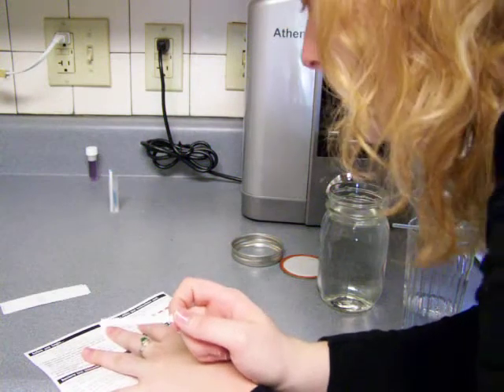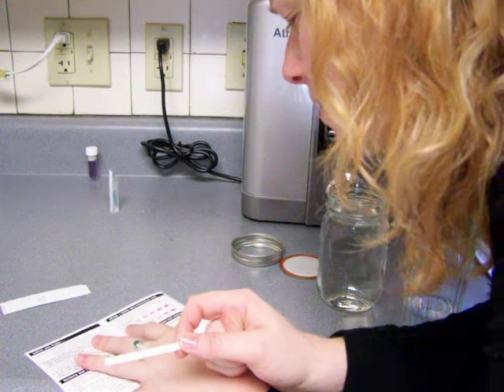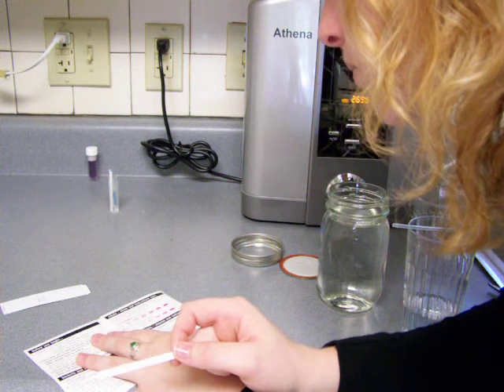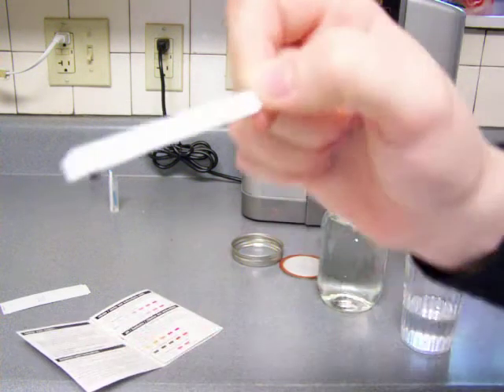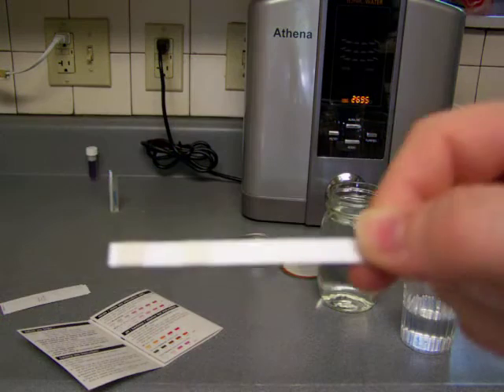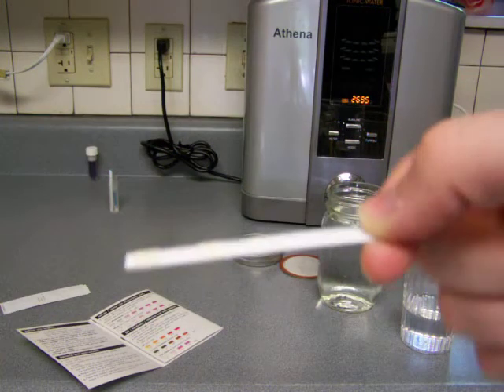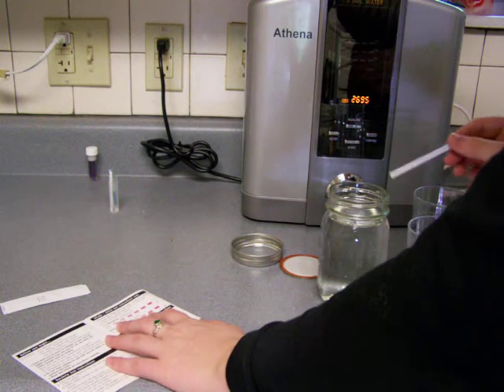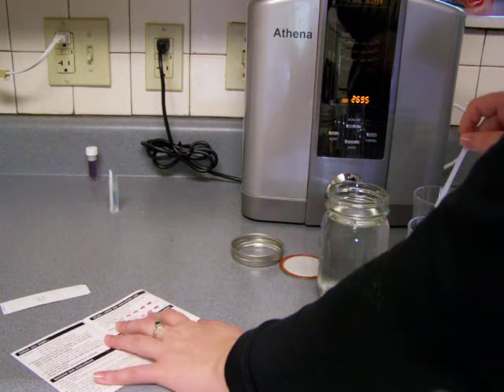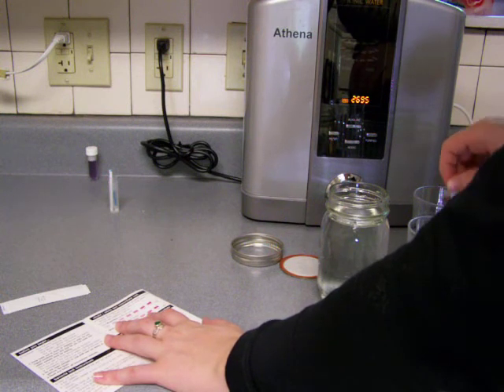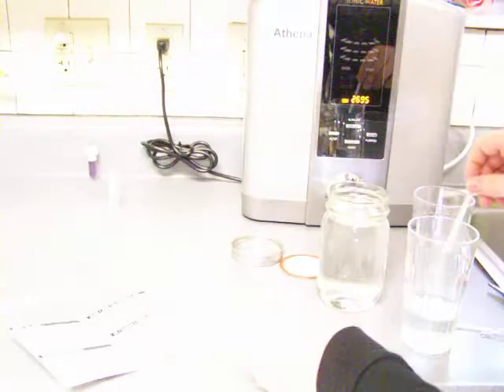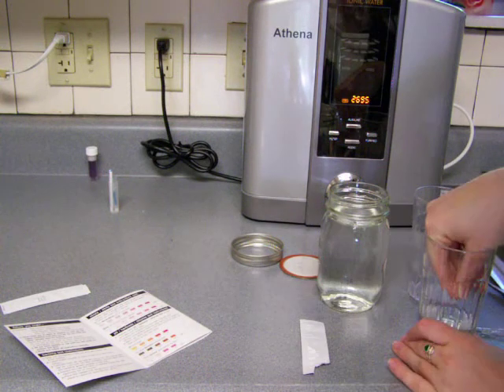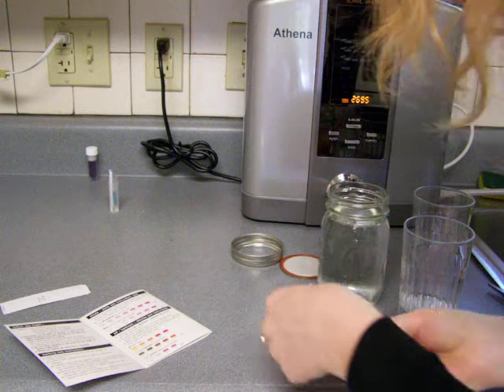It says, immerse the reagent pads into water sample for two seconds. Remove after one minute. Match colors to chart below. One minute. So there's the pads. I don't even know if you can see that, but there's little pads on the strip. Okay. So it says to immerse into water sample for two seconds. So I'm just going to put it on this little thing. So one Mississippi, two Mississippi, and I'm just going to let it sit here.